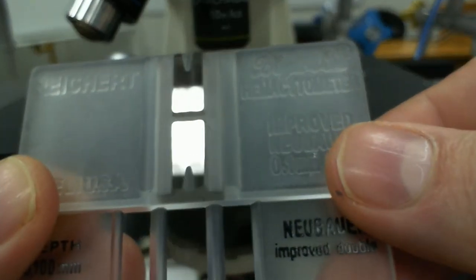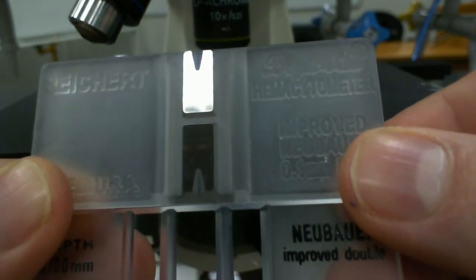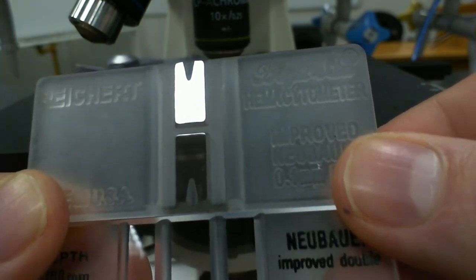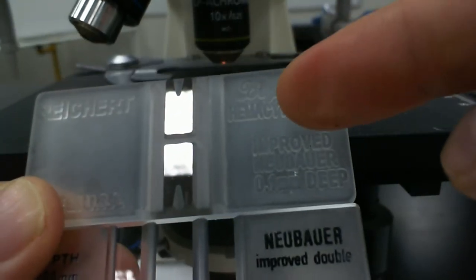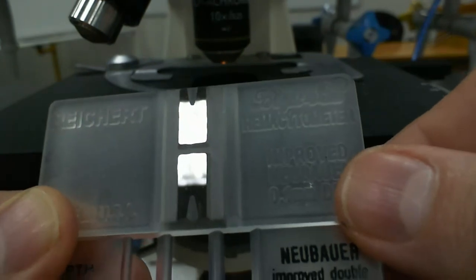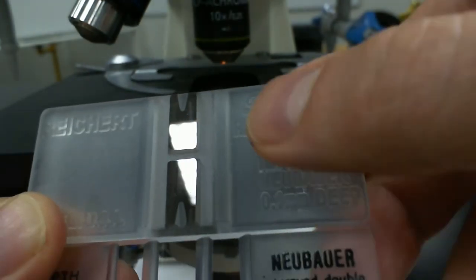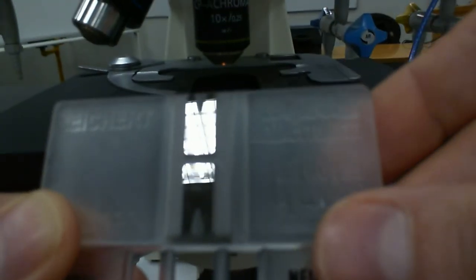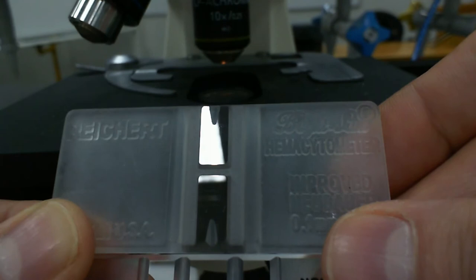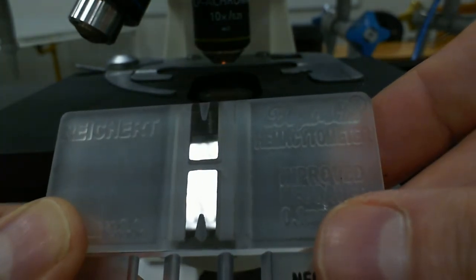The one at the top is a different supplier, I guess, a different manufacturer. They both work the same way. There's a grid on here as well. The one at the top has a more mirrored surface, so it's actually a little bit easier to see and find the grids under the microscope. But in this case here, the shoulders are actually frosted, so it's going to be very difficult for you to get that attachment from the cover slip. So you're probably going to struggle with these ones a little bit more in terms of cover slip attachment.